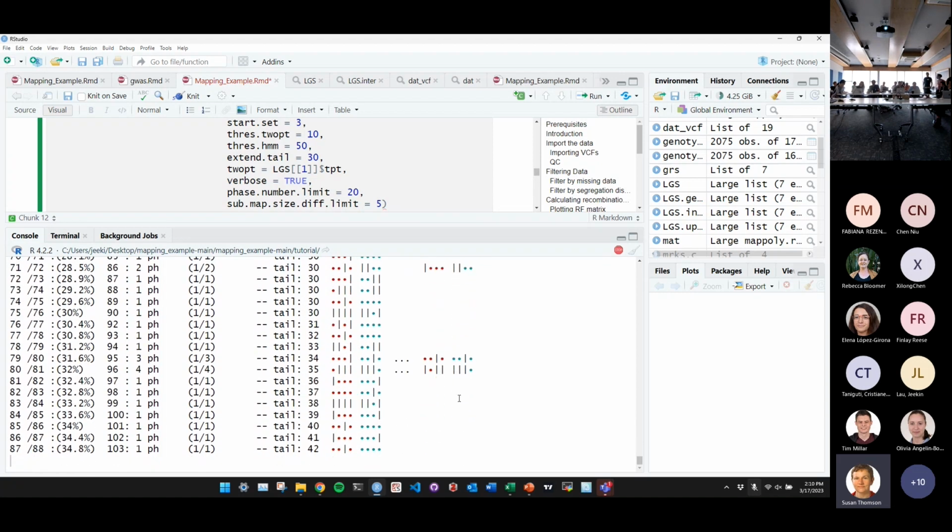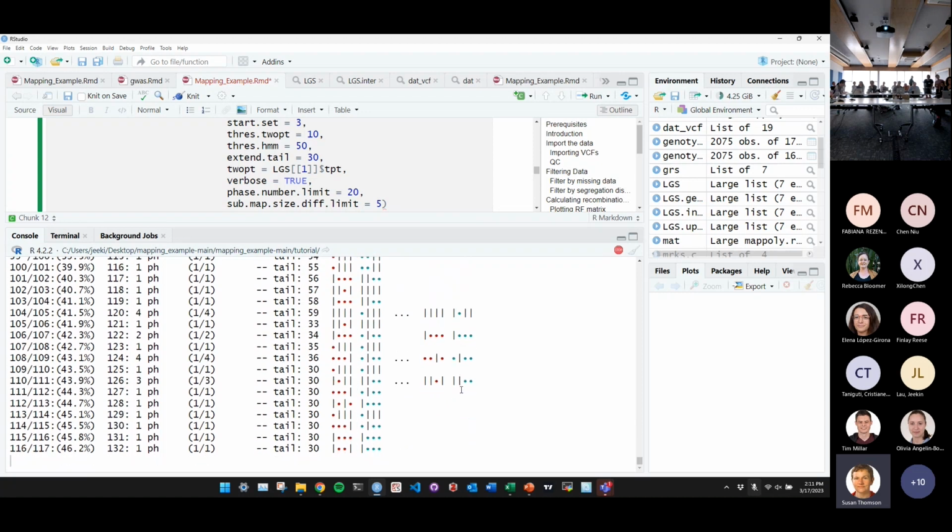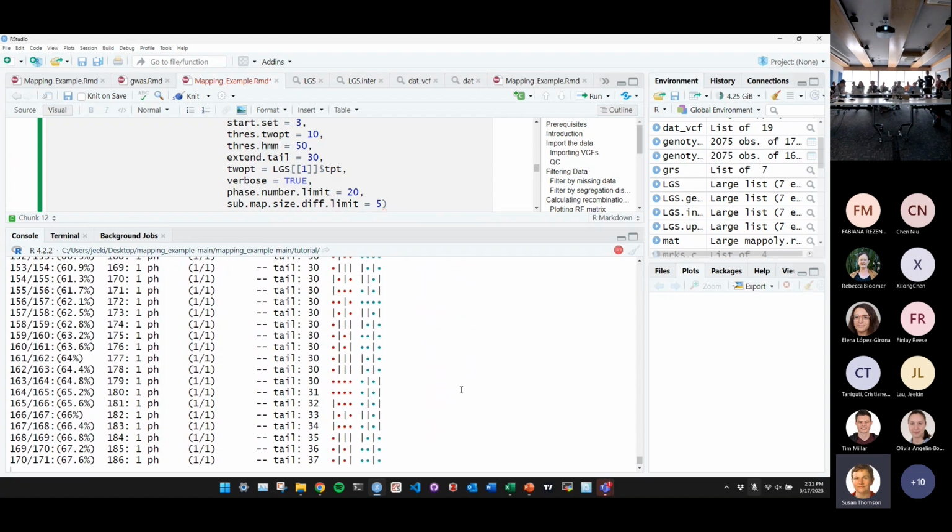What I did was I went to the maps that we have constructed for our papers, and I went into an existing map and took like every 10th marker. So I know they already map well, and then I just take all the markers. So what this is doing is adding markers, adding markers, adding markers. Sometimes if it doesn't fit properly, it'll kick the marker off. But I don't think I've seen any being kicked off, maybe.